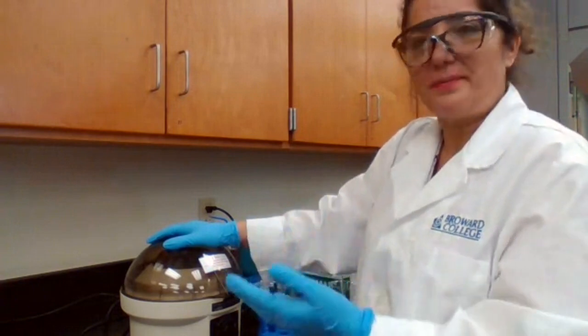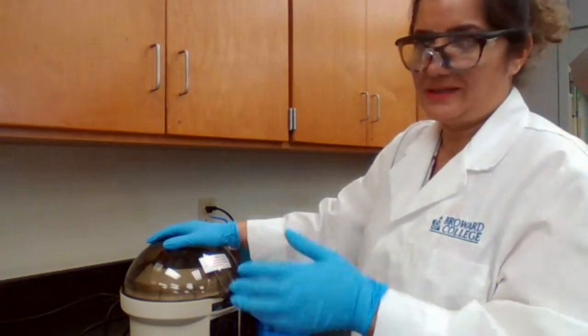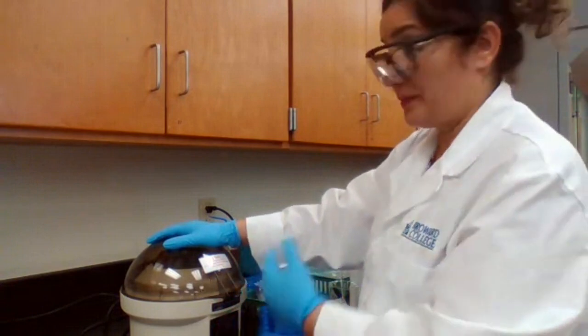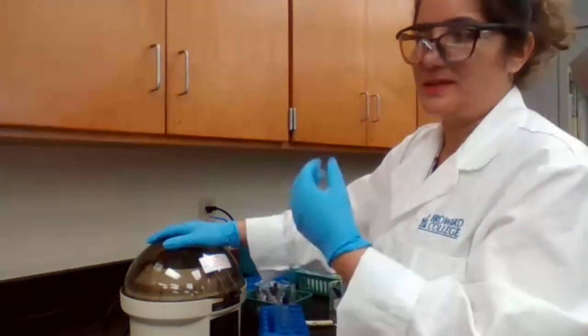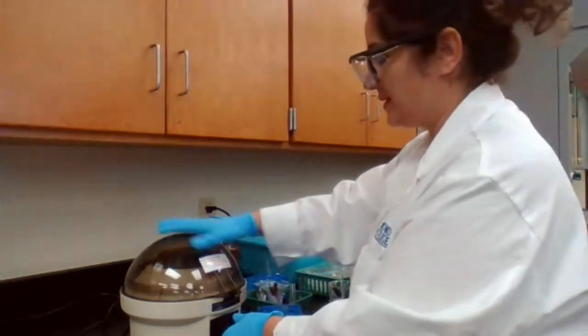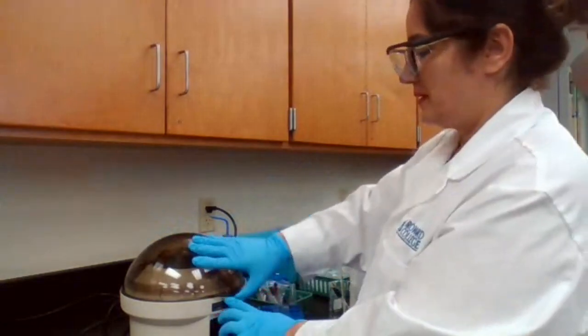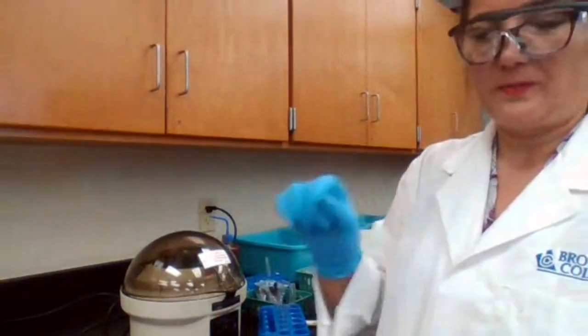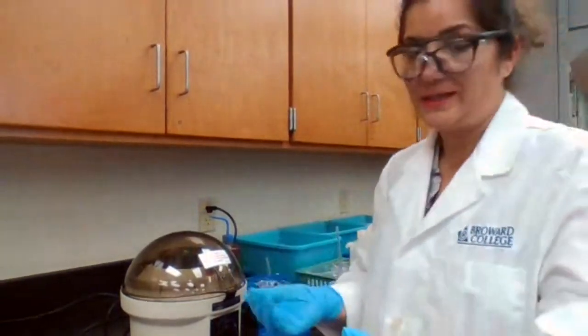With qualitative analysis, we don't have exact measurements. When we say drops, that means an approximate volume, because some droppers have bigger drop size and others smaller. I don't want to be too concerned if 10 drops is now 11 drops. Probably nothing will happen.